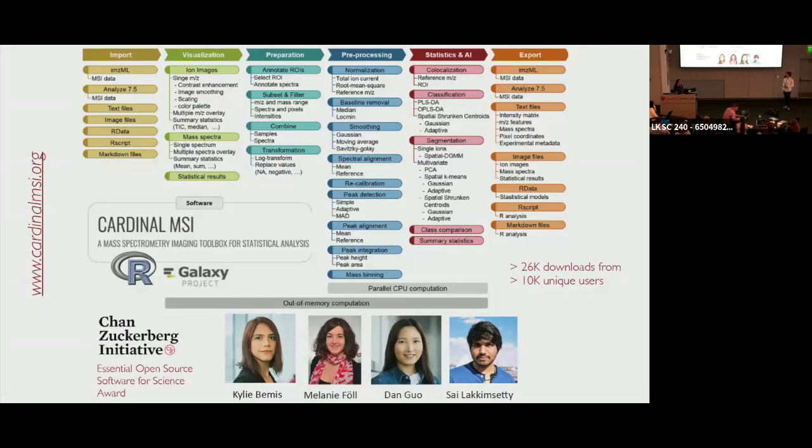Great question. So as far as taking advantage of the existing computational tools that are out there, one of the goals with Cardinal is to make it easily usable by people who may not be initially familiar with coding. It does require programming to some extent, but we try to make that relatively easy. We have great documentation and tutorials, but we also have some short courses. So May Institute, we have a short course series in May at Northeastern. Cardinal session will be part of that, along with beginner and intermediate R. I think we're going to try to have some Python stuff as well there. And we are trying to get a short course approved for next year's ASMS as well.